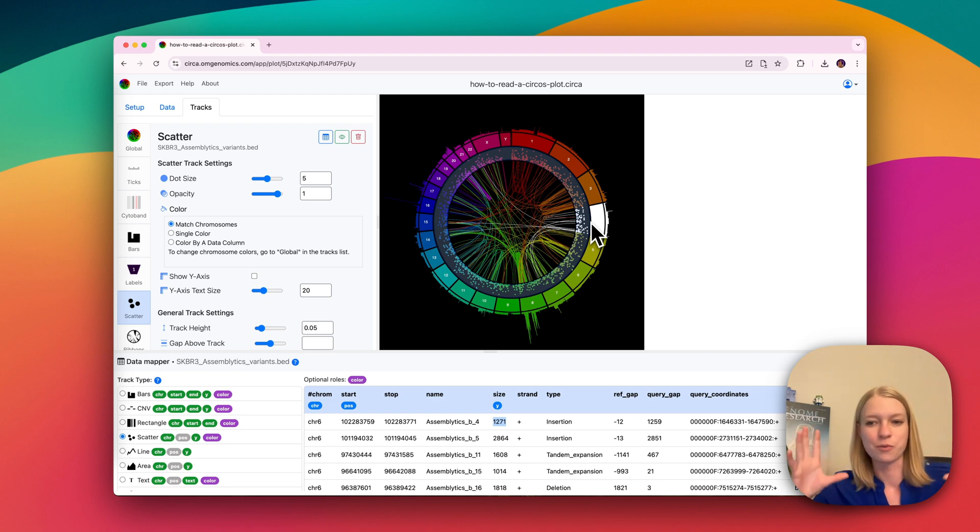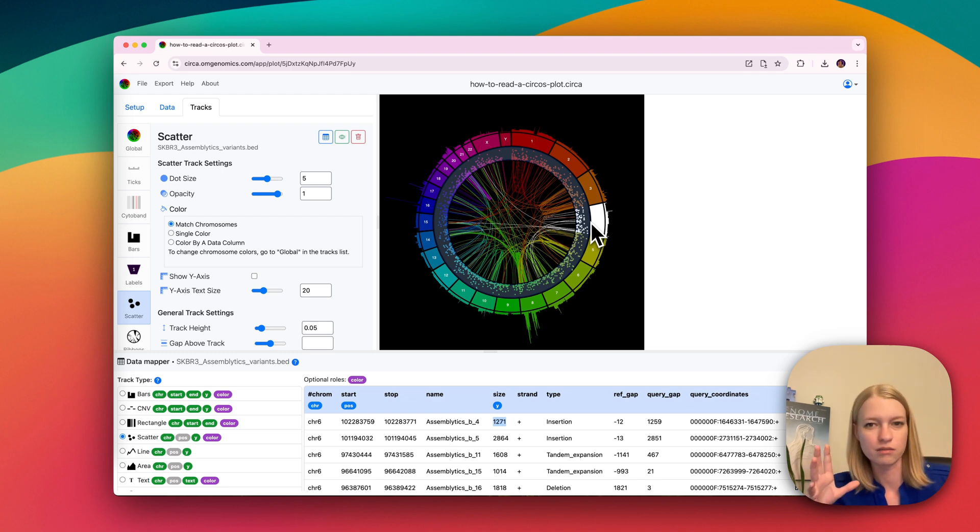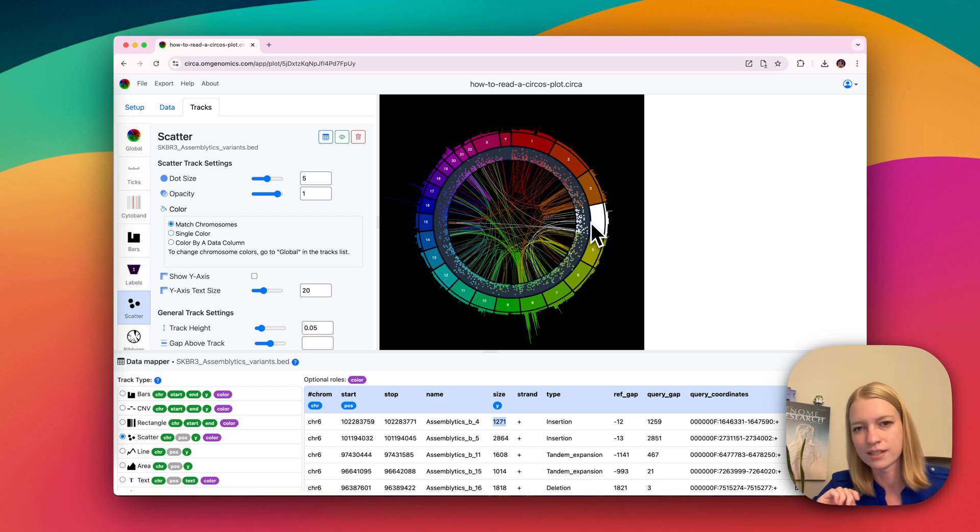But because this is a radial coordinate system, it just looks a little different, but I think it's pretty easy to wrap your head around nonetheless.